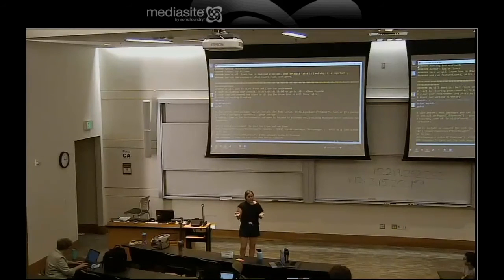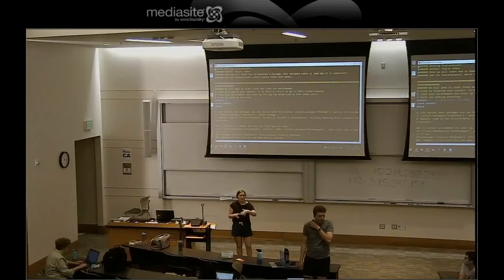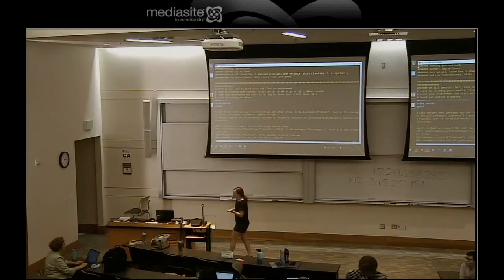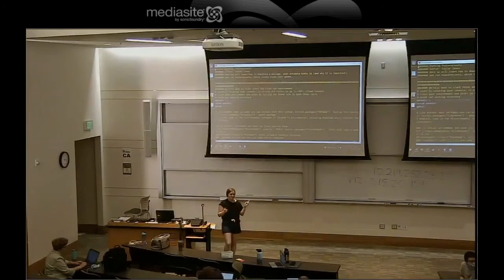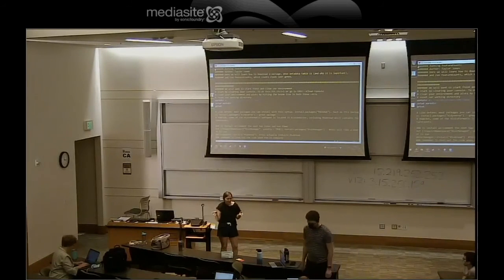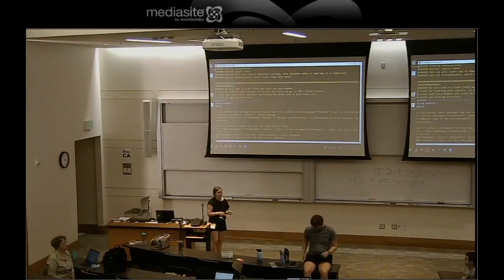Once you have your counts table, you can pull it onto your local computer and do the filtering you've been working on in RStudio, as well as running DESeq after. Ideally we would be running this script I've put on the AWS instance for you, but we do not have the package, which you're learning about. This package is not globally installed on our AWS instance, which means we don't have the tools to run featureCounts right now. Does that make sense?